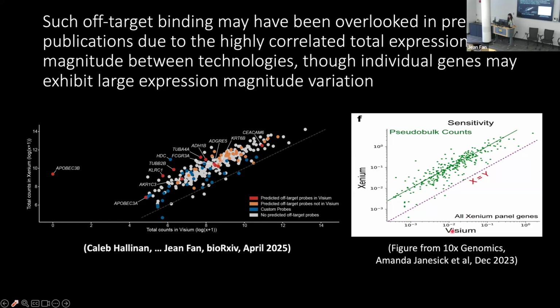This is the published figure where they note that this technology works well because there's a high correlation. And again, we're able to recapitulate it quite well. So you can see our point, their point, their point, our point. This is supposed to be a one-to-one recapitulation.